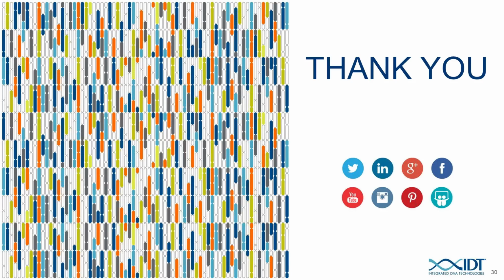So delivering Cas9 as a ribonucleoprotein complex is really the perfect solution in that it's there long enough to do what it needs to do, but not enough time to cause trouble and stick around for too long. And that's really why we don't prefer the DNA delivery approach, where you end up with Cas9 sticking around longer than you'd like.